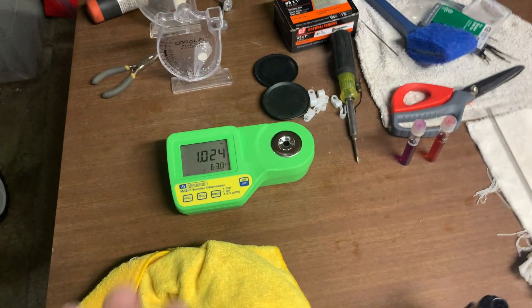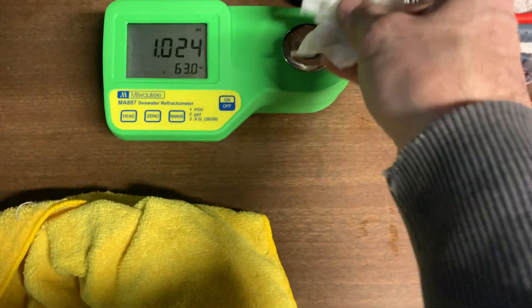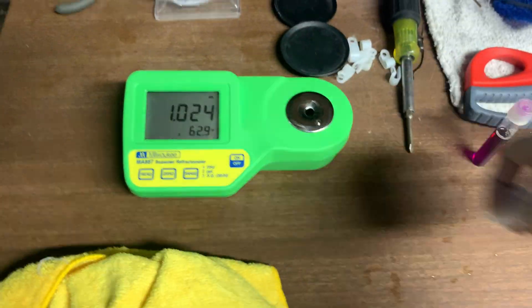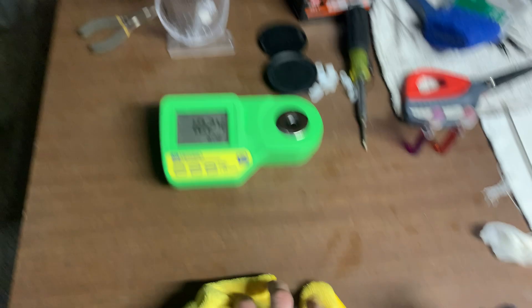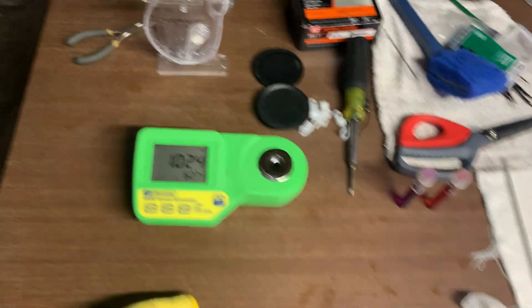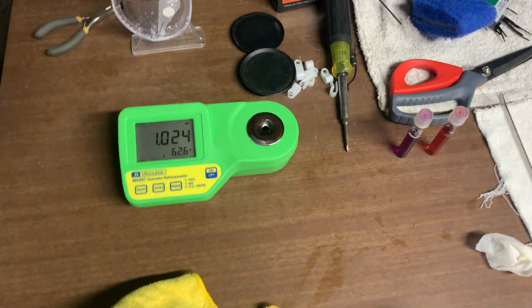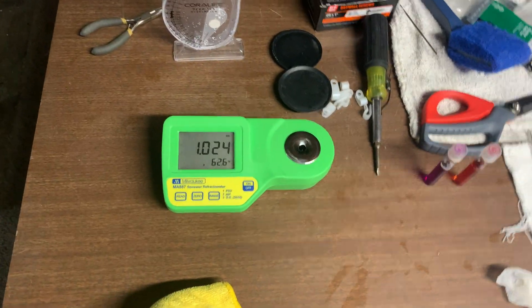Anyway, I thought I'd just go over that. This thing works as it should. And on Amazon, the reviews were like it needs to be calibrated before each test. I don't know why they're saying this — in the book it says it does not need to be calibrated every usage. Calibrate it when you think it needs it.